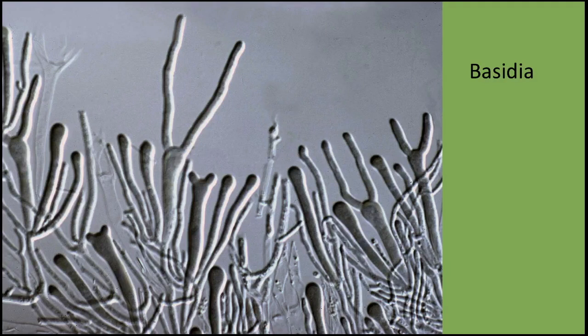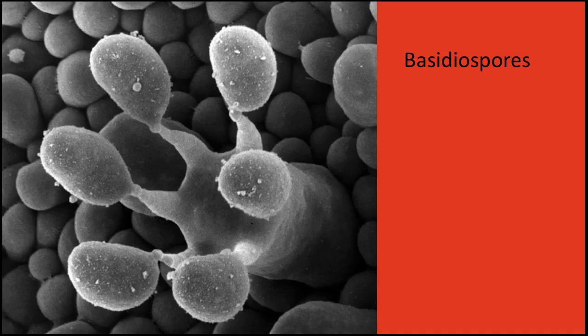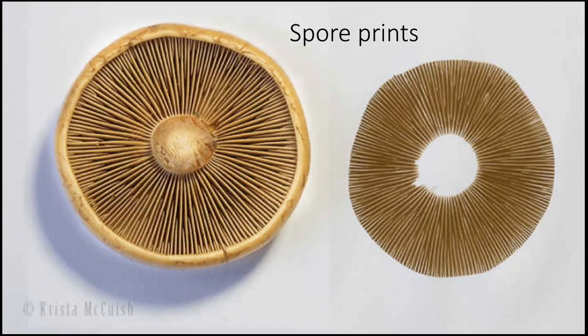Once again, this is just more about the basidiospore itself. You can just see the structure under the microscope. And you can imagine how tiny these are. They are magnified thousands of times in this case. And that's just to show you something that you could not see with your naked eye. So very cool stuff. Now, you can actually make your own spore print, because spores come out of mushrooms and other fungi in millions, literally.